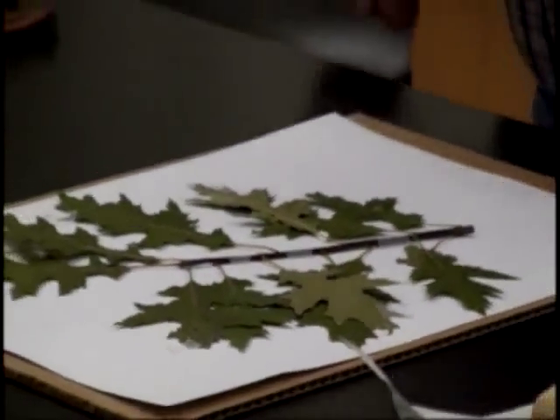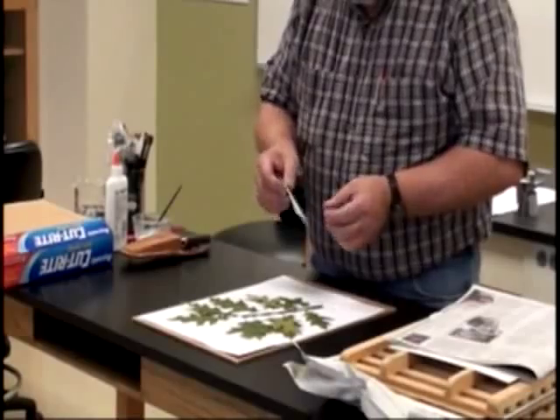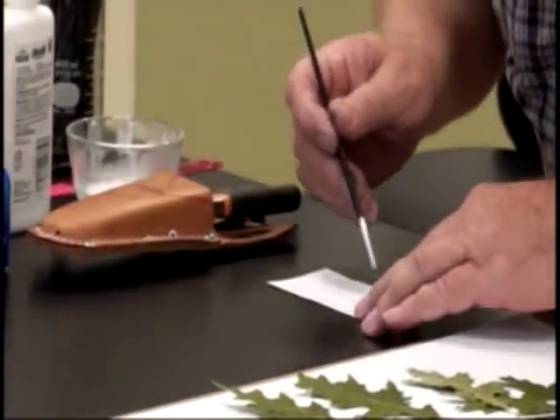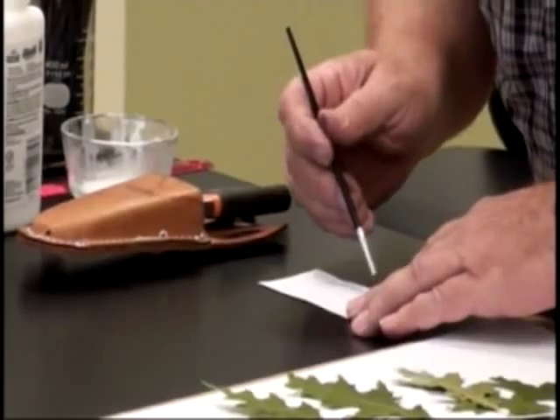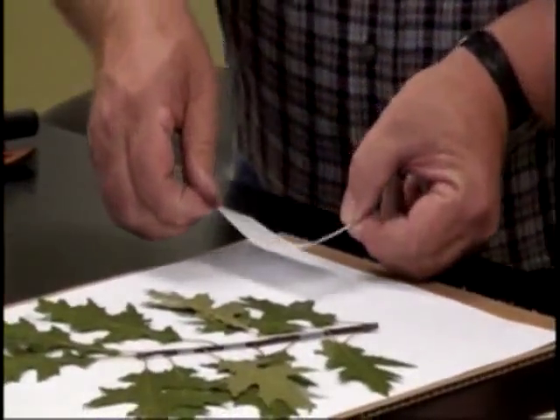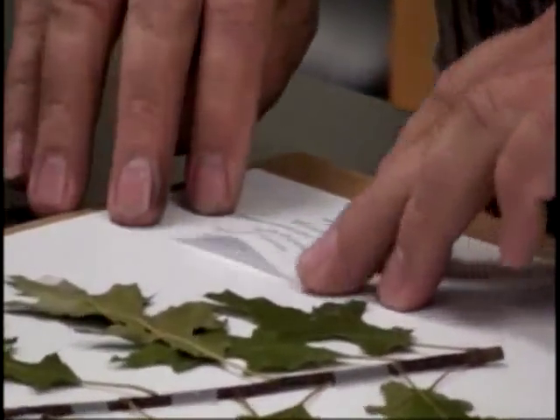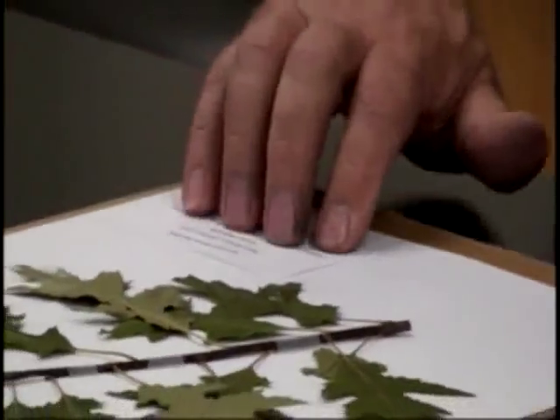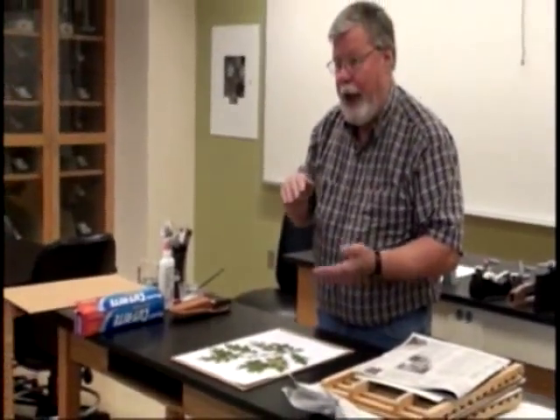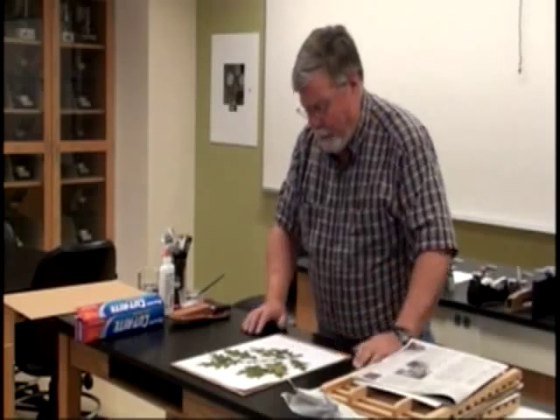Now, the label. You can type this up on the computer or use three-by-five cards — probably nothing bigger than a three-by-five card. Turn it over and put a little bit of glue; you can use double-sided tape or various other things to adhere the label to the herbarium sheet. You don't have to put it in the lower right-hand corner, but we like to have them there because if you're looking at a stack of herbarium specimens, you can thumb through them and the label will always be in the same place.